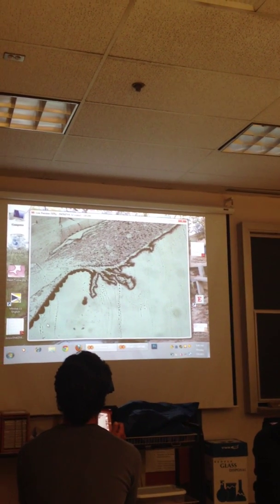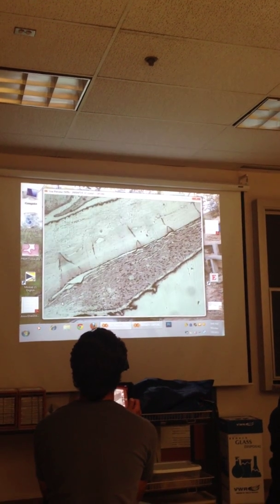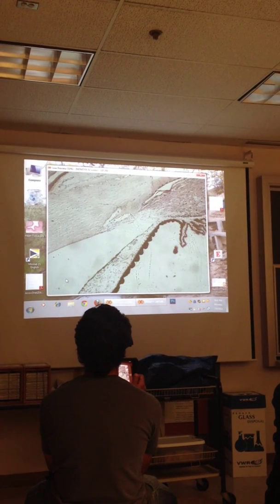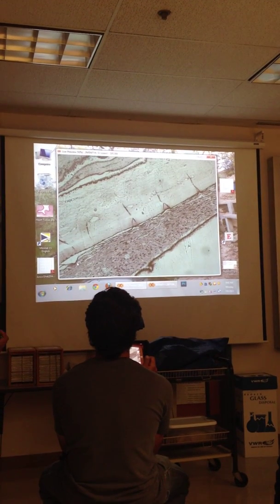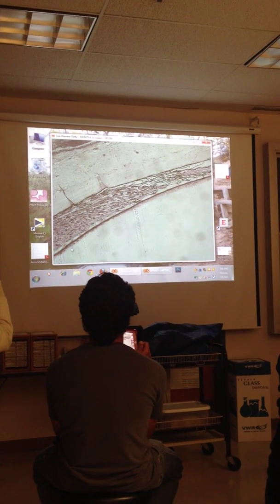On some of the slides it's a little bigger, but we are off towards the lateral side of the eye there. So this is no longer the cornea that we're looking at out here. The cornea dies right here, and the cornea becomes what going over the rest of the eye? Sclera. The sclera.